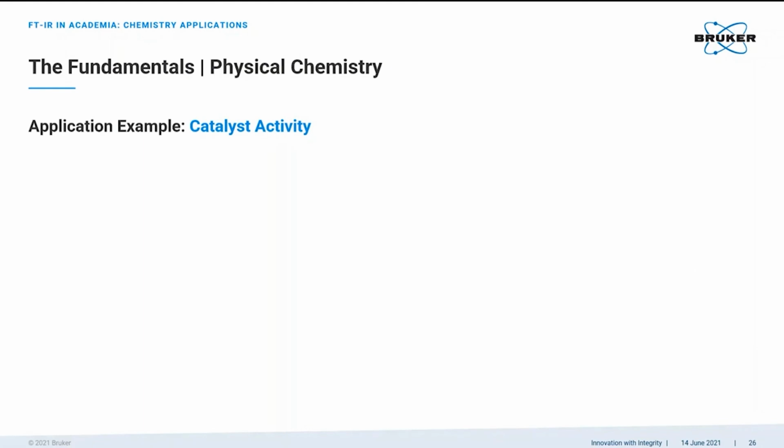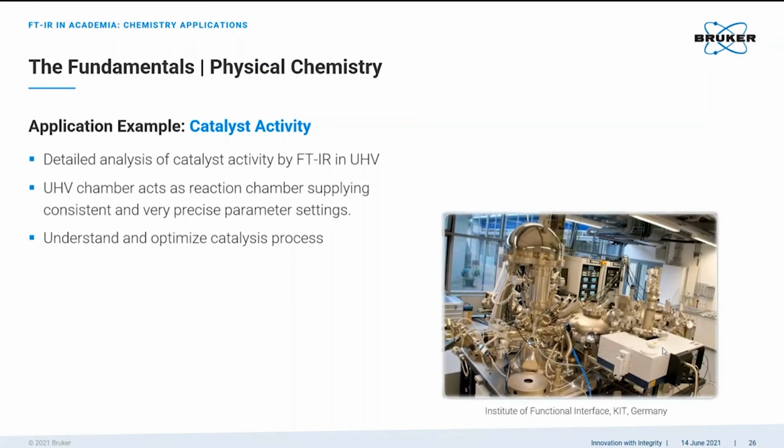Catalysis research is also done in physical chemistry, but in a more fundamental manner. Model systems are investigated which simulate a real catalysis process, but are kept easier and much better to be controlled. Powder catalysts are replaced by single crystals of the same compound, and the reaction chamber is replaced by a UHV chamber.